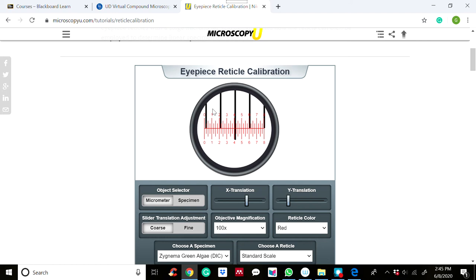This calibration is particularly important when alternating between objective lenses on a microscope. If you are using the 4× objective and want to measure actual length, you need to calibrate using the stage micrometer. If you change to a different objective lens, such as 40×, then you need to calibrate again using the stage micrometer.